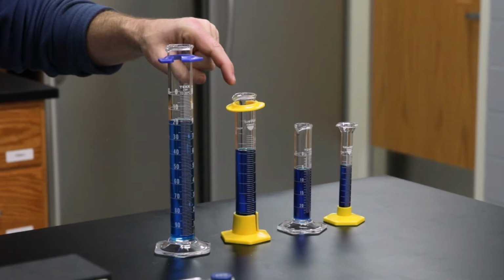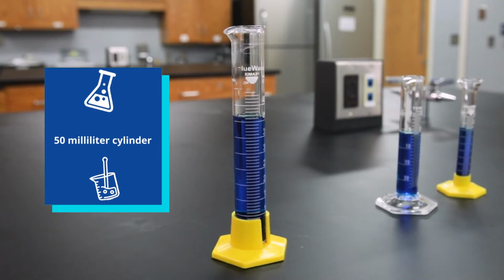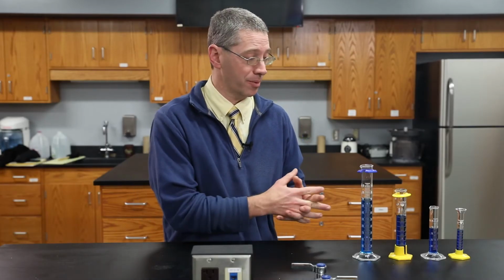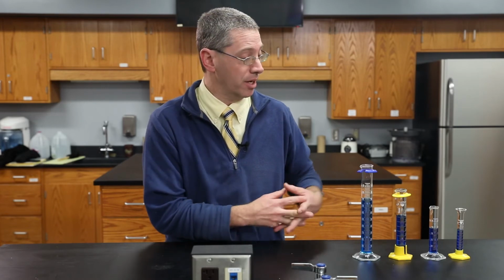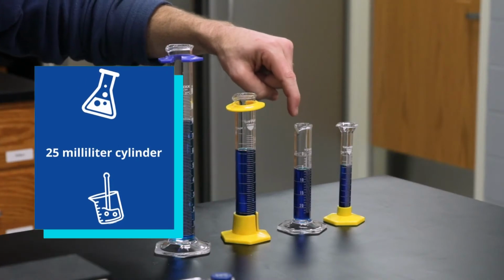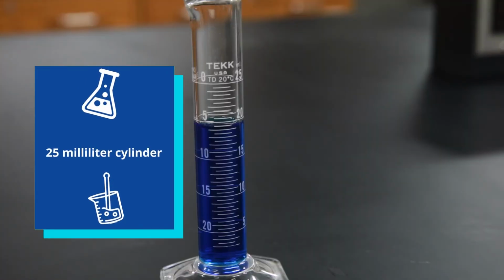When you move to a smaller cylinder, the advantage is that the lines get further apart from each other, which makes it easier to estimate that final digit. Now you might be able to tell that it's 80.2 or 80.3 milliliters. When you go to the smaller 25 milliliter cylinder, the same thing happens. The lines get further apart from each other, which makes it easier to estimate the final digit.